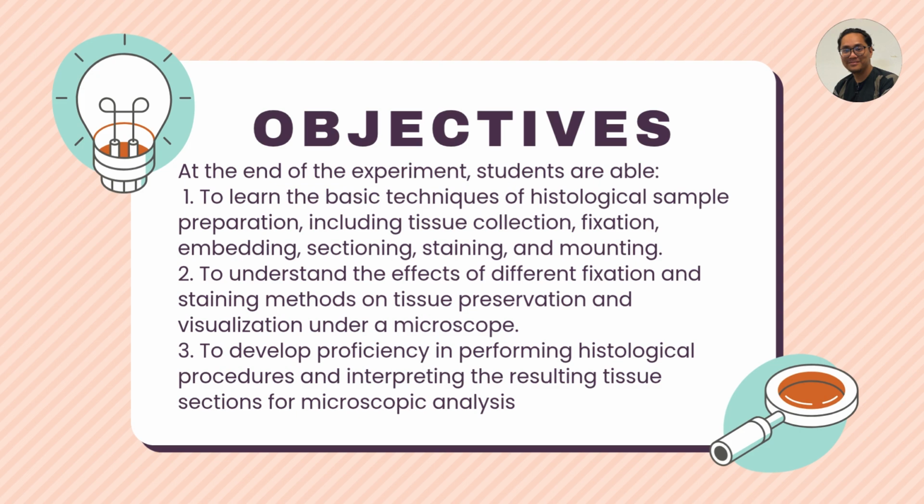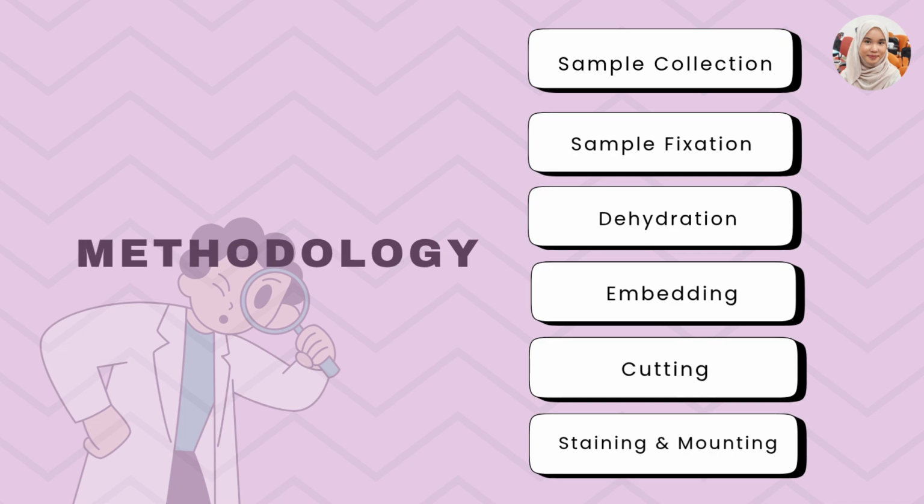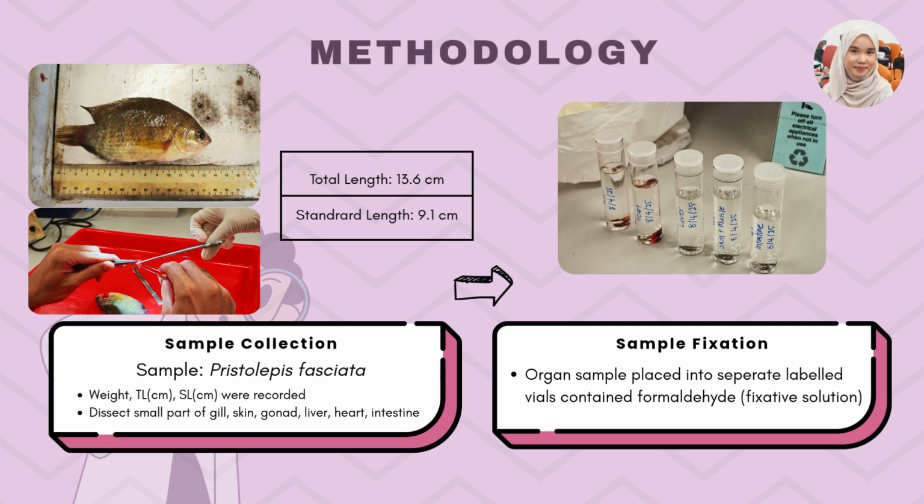Next, we move to the methodology part, which is attaining histology of fish tissues. The method started with sample collection and continued with sample fixation, dehydration, embedding, cutting, staining, and mounting. So the methodology part was initiated with the sample collection.